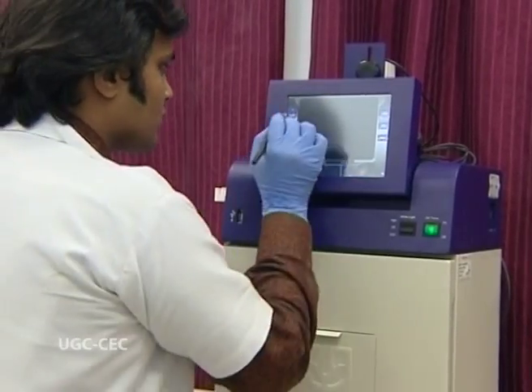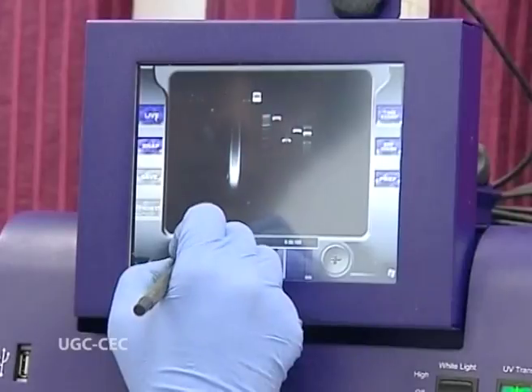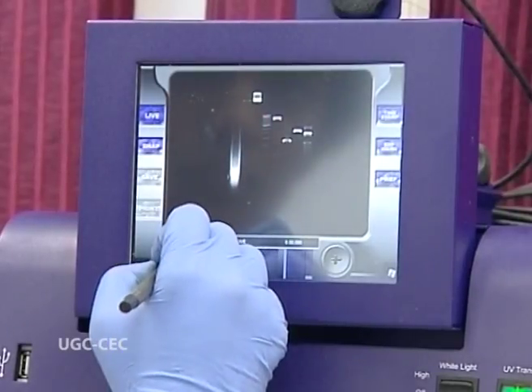Now this can also be seen on the gel doc system. On the gel doc, we see black and white bands, and for research publication sometimes it becomes very essential to look at the picture like that.